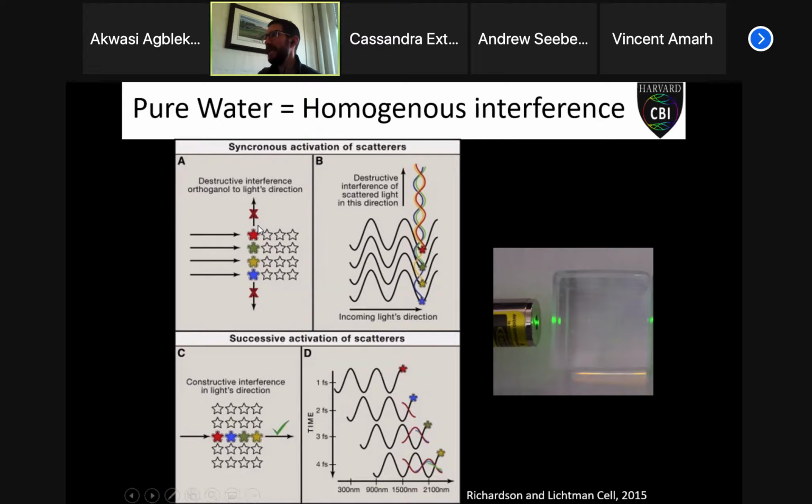So the light coming out looks exactly the same. It has the same wavelength, the same amount of energy. There's no change in color or anything like that. There's no energy lost in this process. The only difference is that it can come out in any direction. And sorry, there's one other difference as well: this interaction obviously takes time. So if you want to think of light as a wave, that wave has been slowed down a little before it comes back out. So it's been shifted.